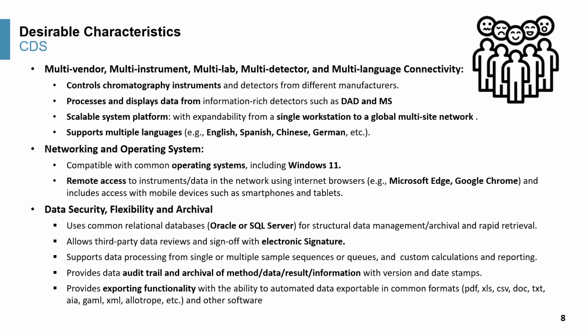Here's a listing of desirable characteristics of a CDS. I would not comment too much. This is a listing for your information, such as multi-vendor connectivity, ability to control and take data from multiple instruments, multiple labs, multiple detectors, and also supporting multiple language connectivity. And those are some of the finer details: control chromatographic instrument, process, and display data.